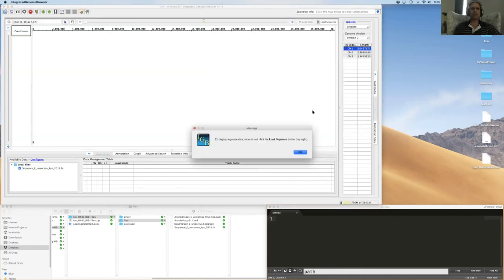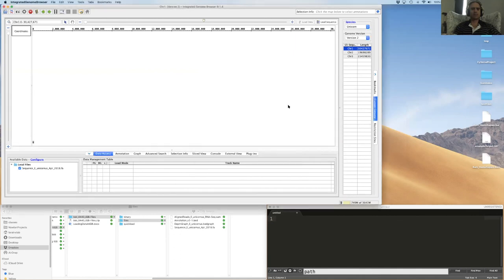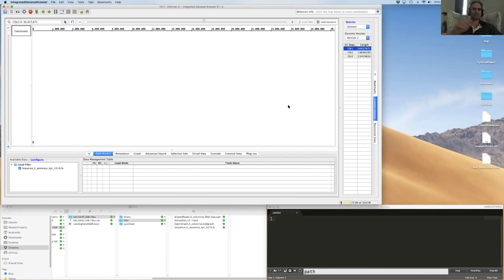An interesting fun fact about SAM and BAM files: for one of the plants we care about, the binary BAM file is 16 GB in size, while the same SAM file in plain text is 89 GB. That gives you an idea of why we work with BAMs versus SAMs — the size discrepancy is huge.